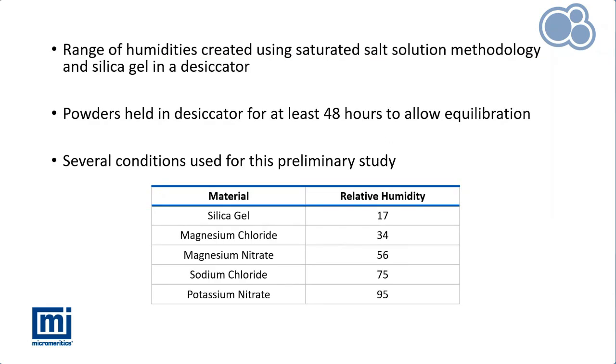The samples were held in a desiccator with a saturated salt solution, and we allowed them to equilibrate for 48 hours. The 5 different conditions used range from a relative humidity of 17% all the way up to 95% RH.